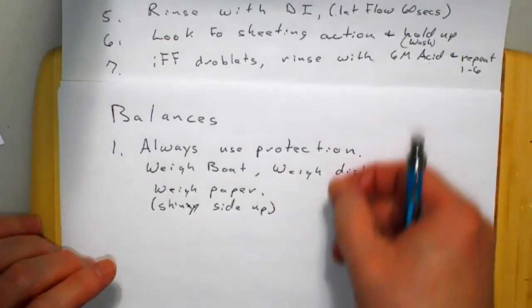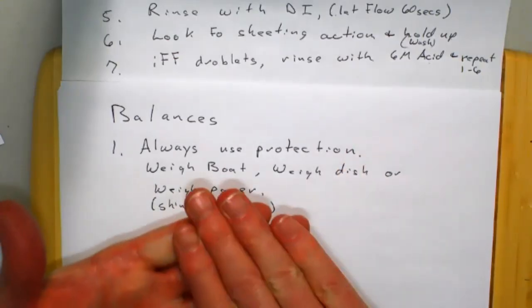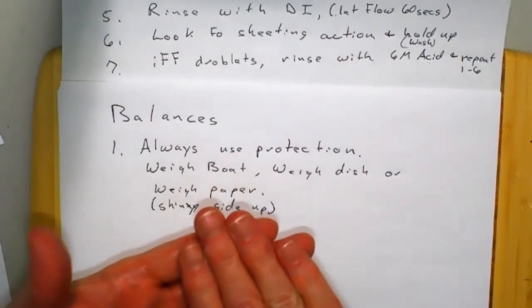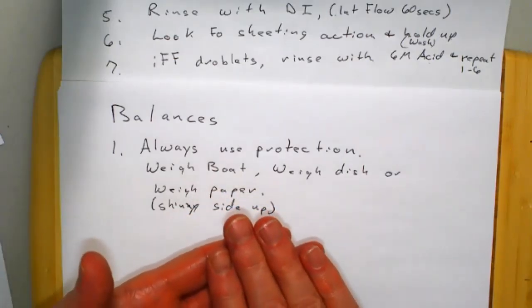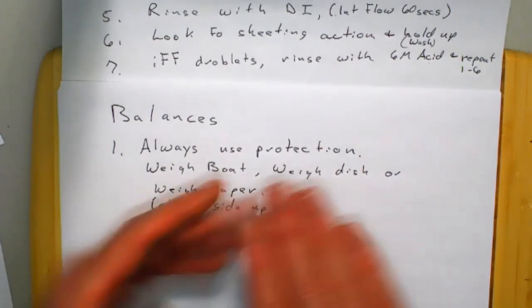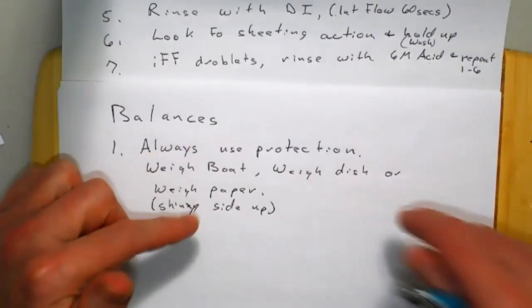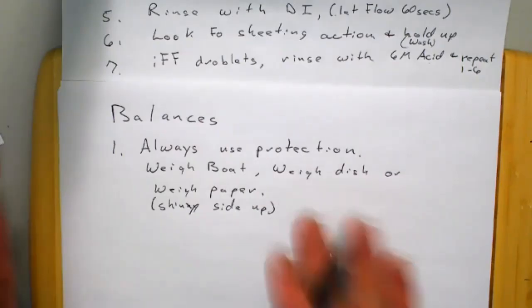As you slide the paper onto the balance, you're going to rub off some electrons from whatever that material is, a weigh boat, weigh dish, or weigh paper. Those little fuzzes on that weigh paper are to put the electrons back on the metal pan. So weigh paper's real handy.